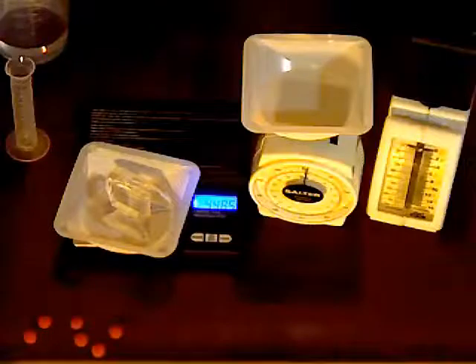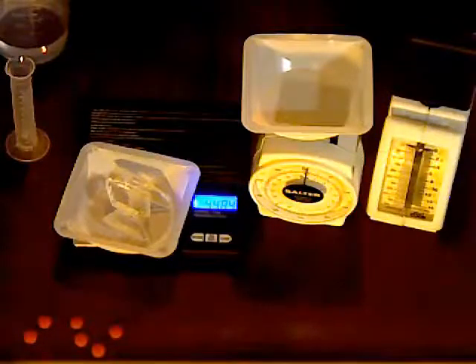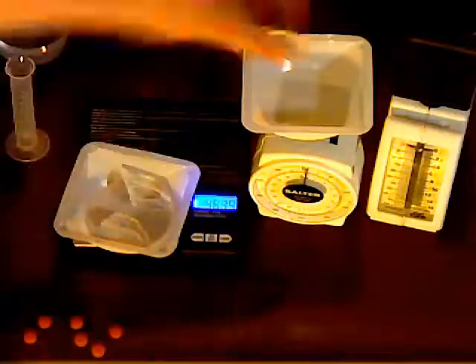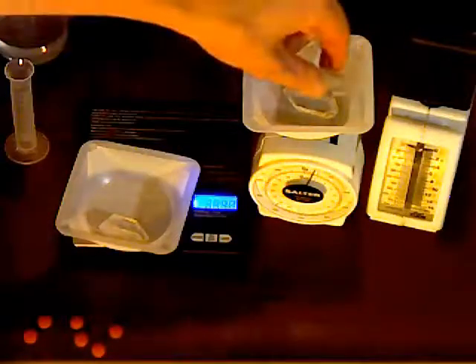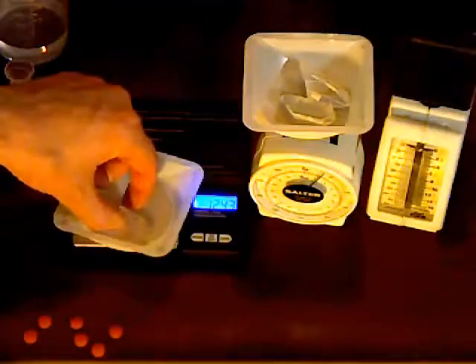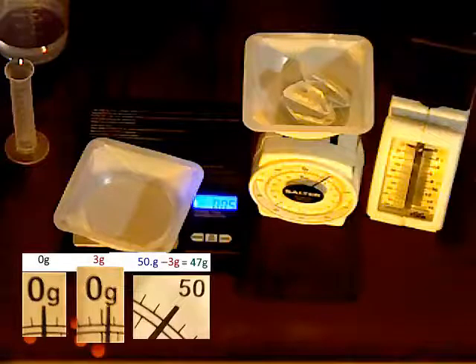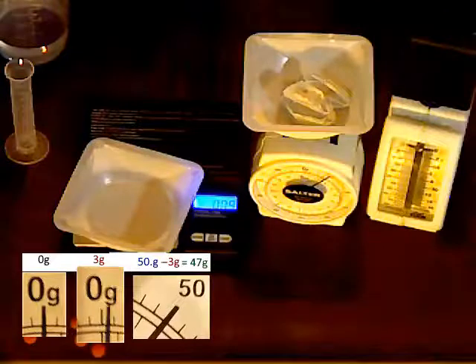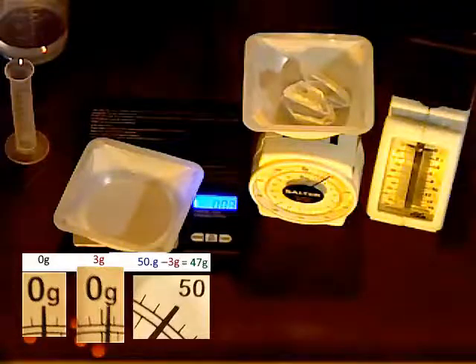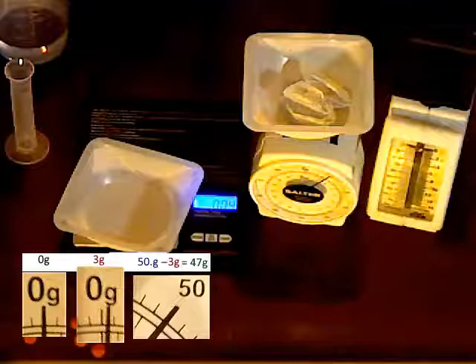Here I get 4 digits of precision, or 4 significant digits. Every single digit displaying on the scale is significant. If I move these to the less sophisticated scales, I indeed also see, if I were to go on a close-up look, that this is greater than 44 grams and less than 50 grams.